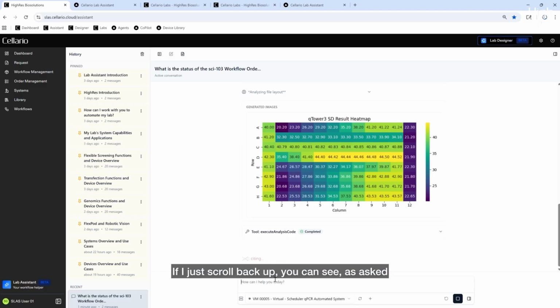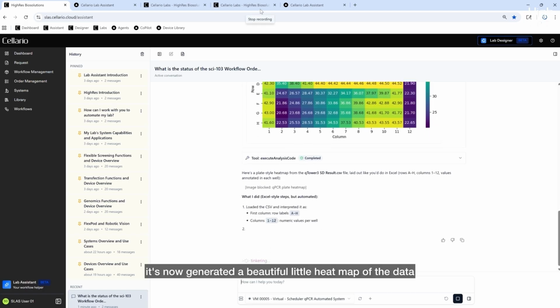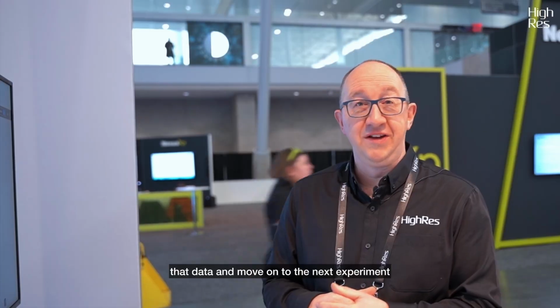If I just scroll back up, you can see, as asked, it's now generated a beautiful little heat map of the data that came out from that qPCR instrument. And I could from there carry on, do some further analysis, or perhaps that's enough for me to interpret that data and move on to the next experiment.